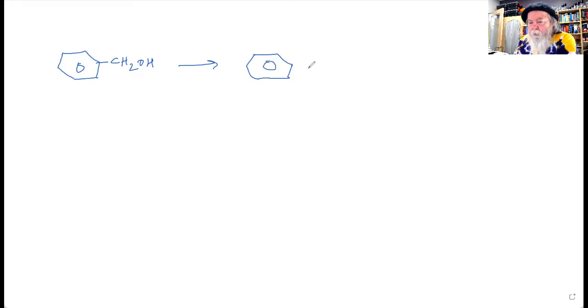of lots of transformations. In this case, we're trying to take benzyl alcohol and convert it to benzoic acid. Today's product, we're actually going to recover and recycle. We're going to reuse this in 3010 lab and possibly 3005 lab. So the product you're making today is not going to go to waste. We're actually going to reuse it, recycle it for different experiments. So this is a primary alcohol going to an acid.